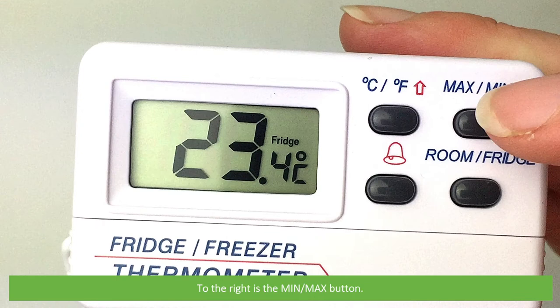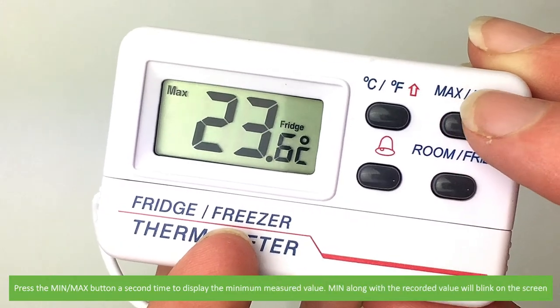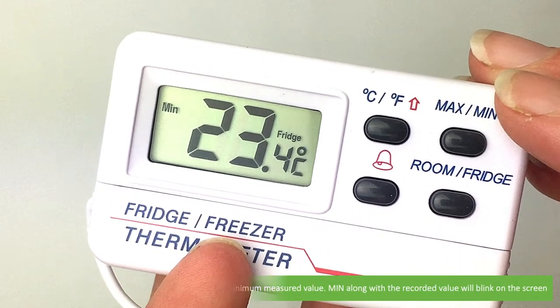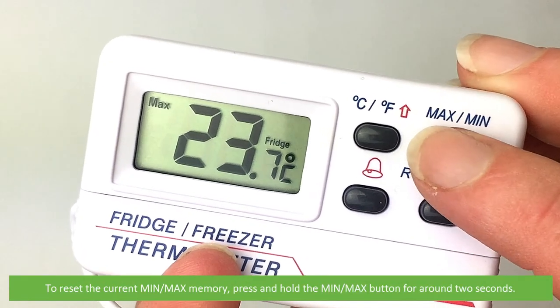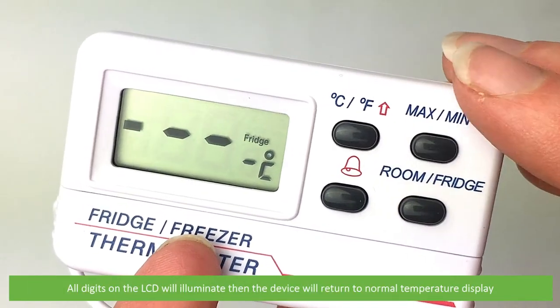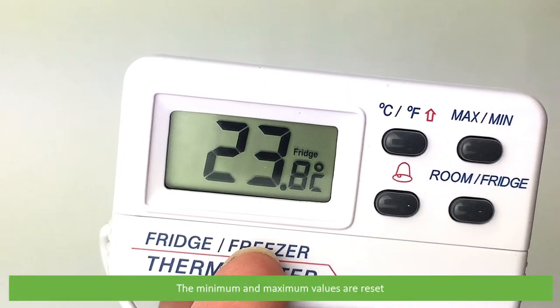To the right is the min max button. Press the min max button one time to display the maximum measured value — Max will blink on the screen. Press the min max button a second time to display the minimum measured value. To reset the current min max memory, press and hold the min max button for around two seconds. All digits on the LCD will illuminate, then the device will return to normal temperature display and the minimum and maximum values are reset.